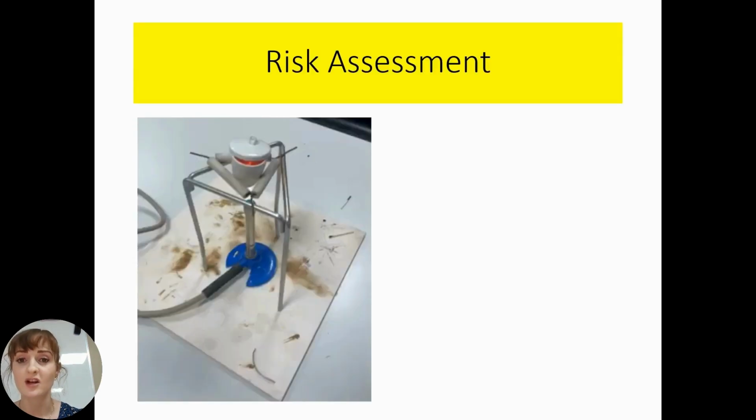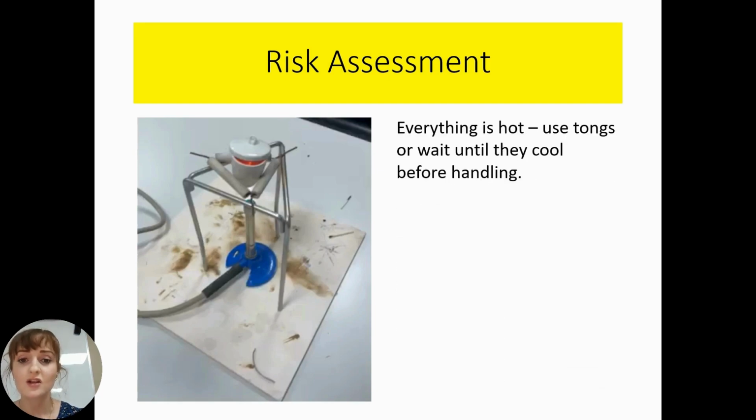The first thing to note in terms of risk is that obviously because you are heating the entire apparatus, it's going to be hot. So you would take care to hold things with tongs or else just to wait until everything cools before you begin to handle it.